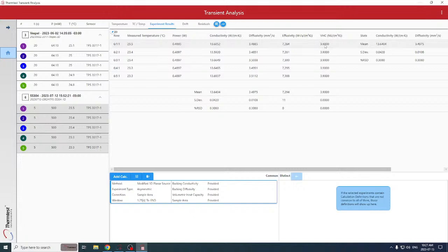So, excuse me, the volumetric specific heat was inputted, and we have calculated conductivity and diffusivity. So again, this is ideal for elongated materials where you have limited radial size and samples that are larger through the thickness, if you will. It does have unique capabilities for materials that are heterogeneous. It does measure an isolated amount of material, which has its advantages. So that is the one-dimensional effusivity covered in the -7 standard.